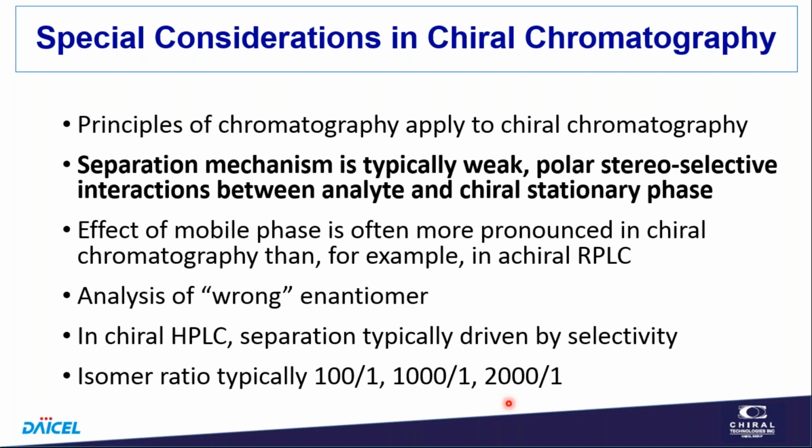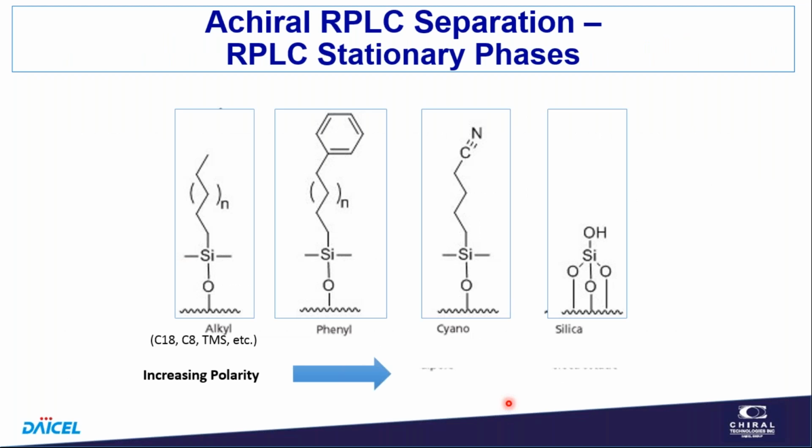The separation mechanism in chiral separations is different than we typically see in reversed phase or normal phase or other separation techniques that you may be familiar with. In achiral chromatography, we're used to seeing things like C18, which is a fairly lipophilic stationary phase with a pretty first-order interaction between analyte and stationary phase, just partitioning principally on bulk polarity. We can add some functional groups and change a little bit of selectivity and add some polarity, so increase the retention of polar compounds. But basically, we're looking for a single mode interaction.